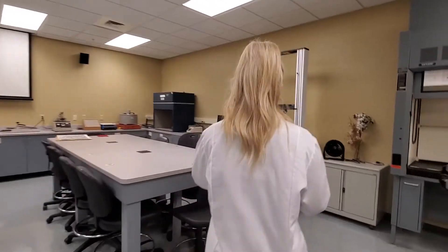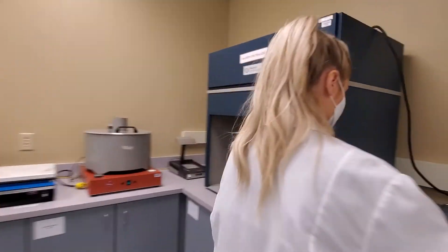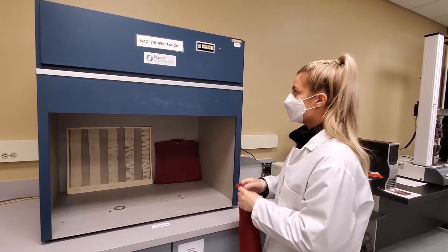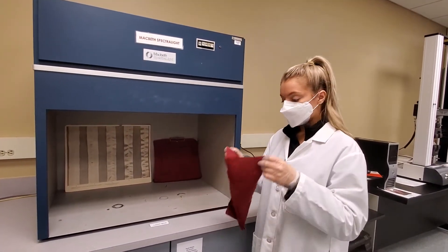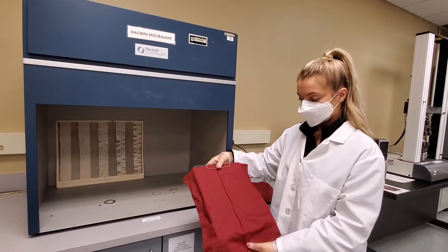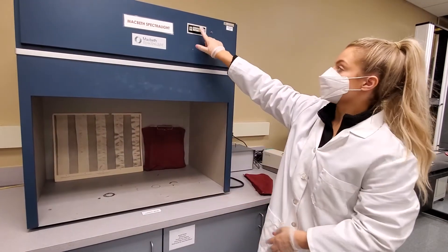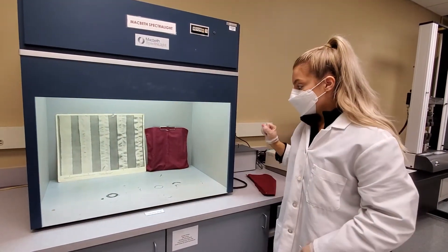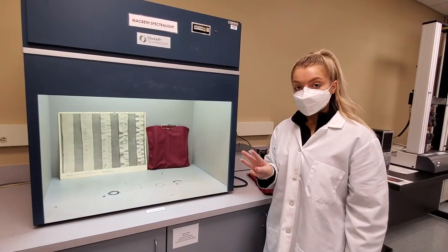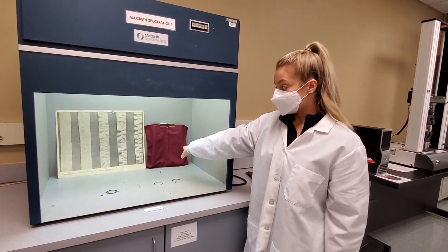This is where you're going to evaluate the smoothness of your seams based on the examples. You're going to go over to the Macbeth Spectrolite and place your specimen onto the clear mounting board. Then once mounted, you're going to turn on the fluorescent light. Then you're going to take your examples, and three members of your group are going to independently evaluate the smoothness appearance of your seams based on the rating scale.